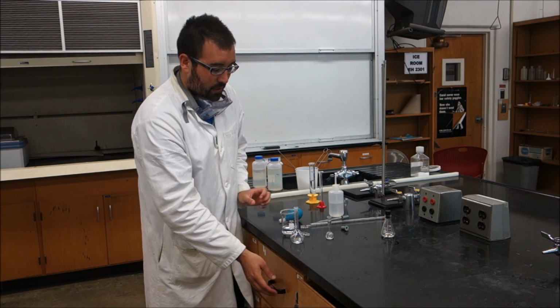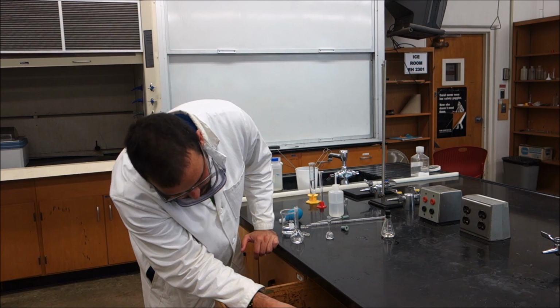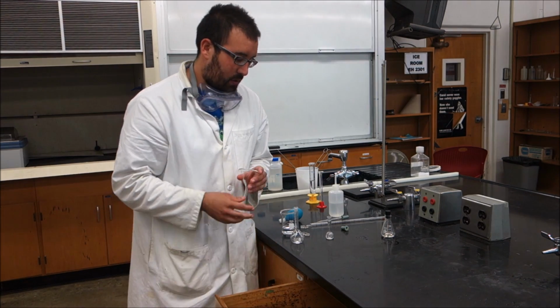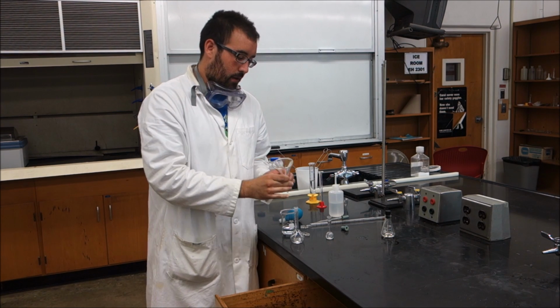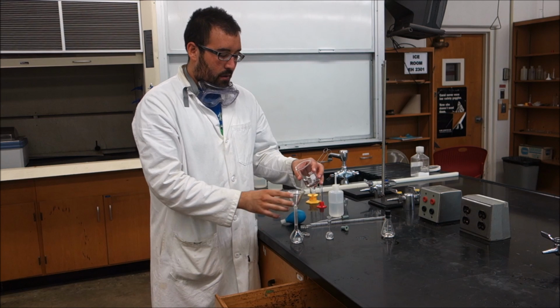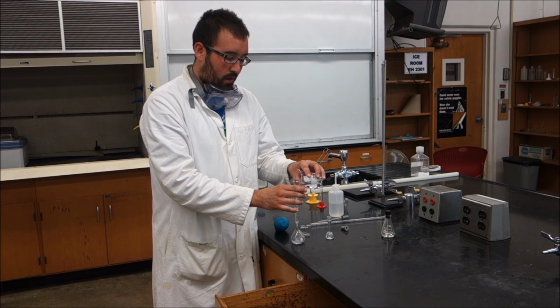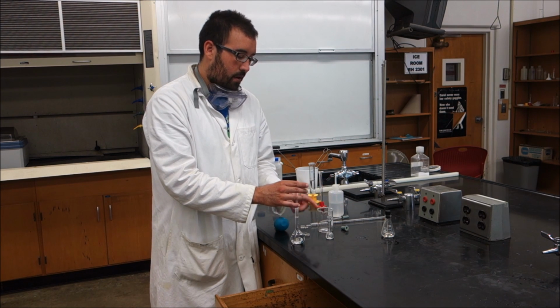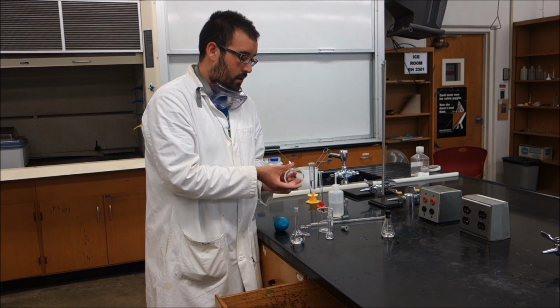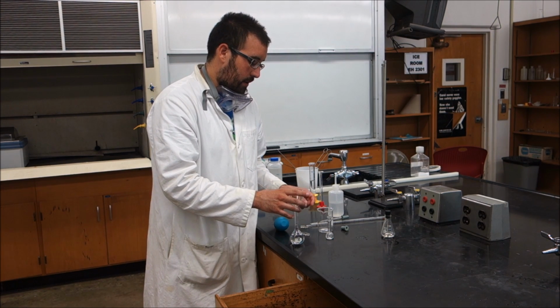Now, when you transfer it, what you want to do to avoid spilling is use a short stem funnel. And the short stem funnel can be found in your drawer, just as I showed you, right here. We'll put it over the top. We'll hold it above it just gently, and then we'll pour our liquid in there. And much in the same way that we topped off our 10 milliliter volumetric flask, we're going to do the same thing for our 50 milliliter.